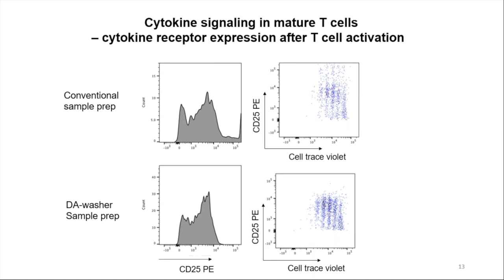So it is one of those things. It does look like, well, it's magic, it's impossible, but so far we have never experienced that, and I believe it just doesn't happen. I think it's more likely we'll mix something by mistake when we are doing the conventional sample prep and manually pipetting for the washes. So I'm actually confident there is no sample mixing.